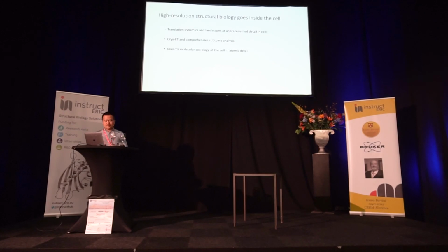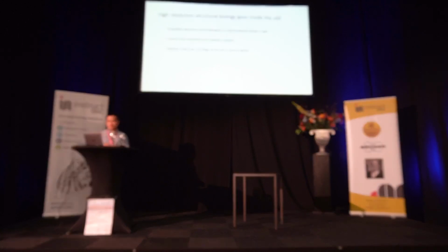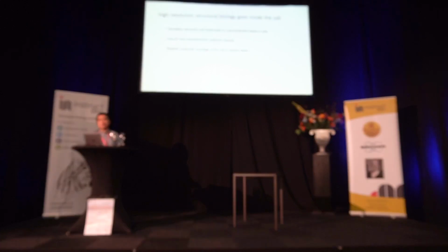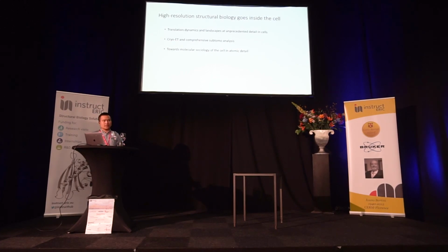And we believe this is the start of an exciting time of cryo-ET and in-cell structural biology with other integrative structural approaches, such as in-cell cross-linking.